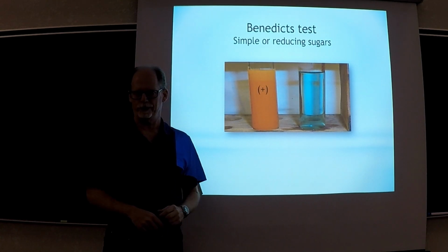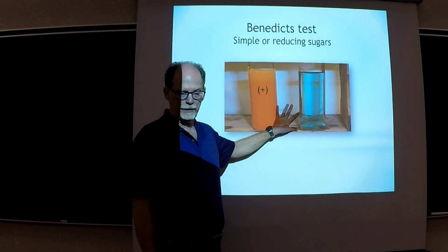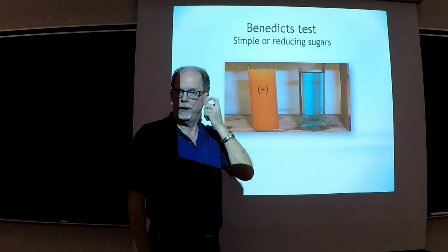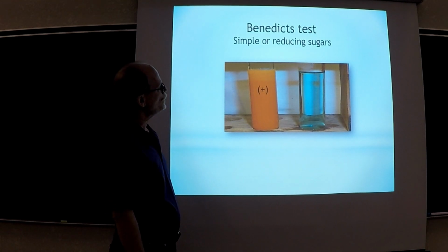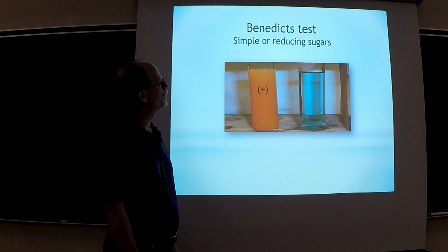simple sugar present. So on the practical, you might see this image, and then I'd expect you to tell me which one's positive, what's the name of the test. So those are the kinds of questions. It tests for what? Right, simple sugars, reducing sugars.